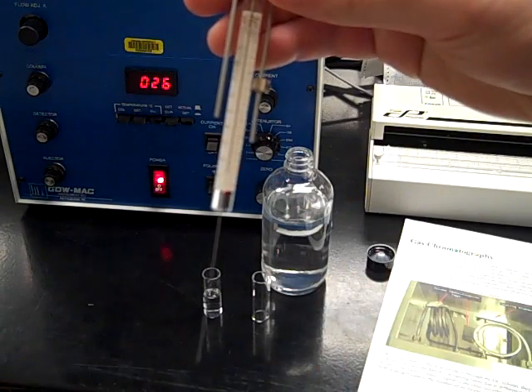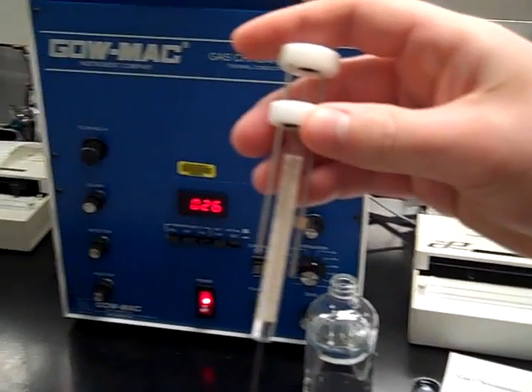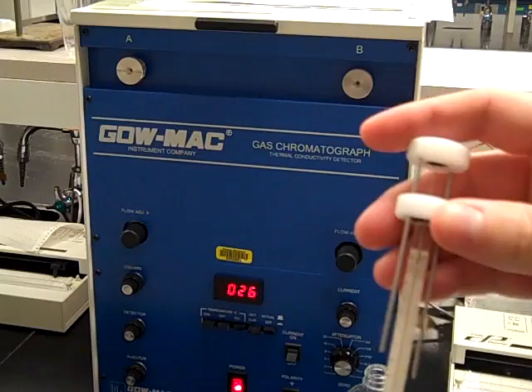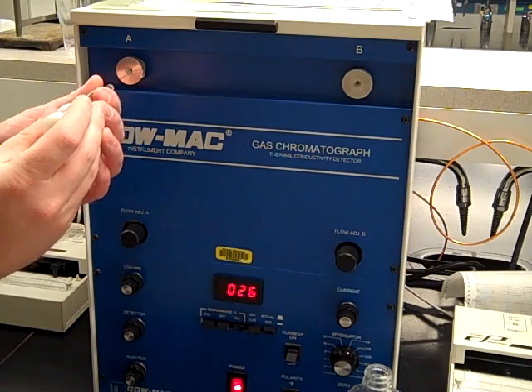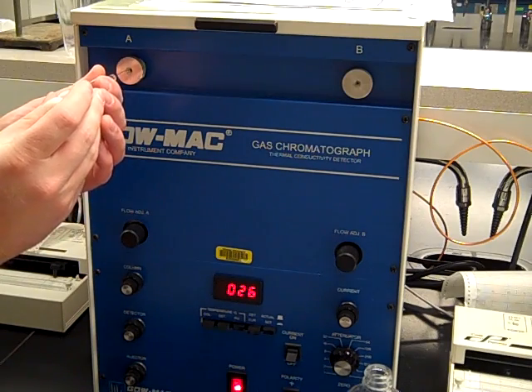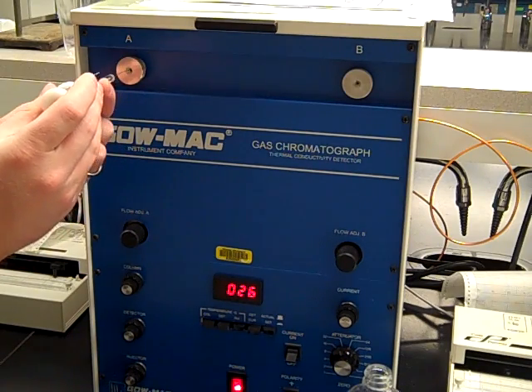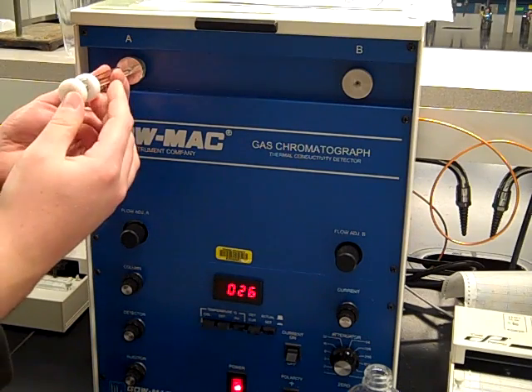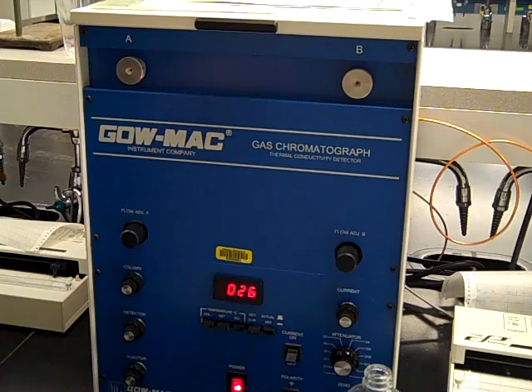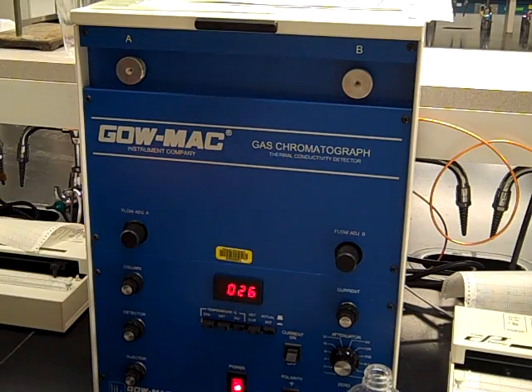Once you've got that one microliter, then you're going to come up to injection port A, and that's where you're going to inject your sample. As you're inputting the sample, you're going to be careful because the needle is going to touch a rubber septum. It's going to put some resistance. Once you push it in all the way, push, pull it out. You want to do that in a quick motion.